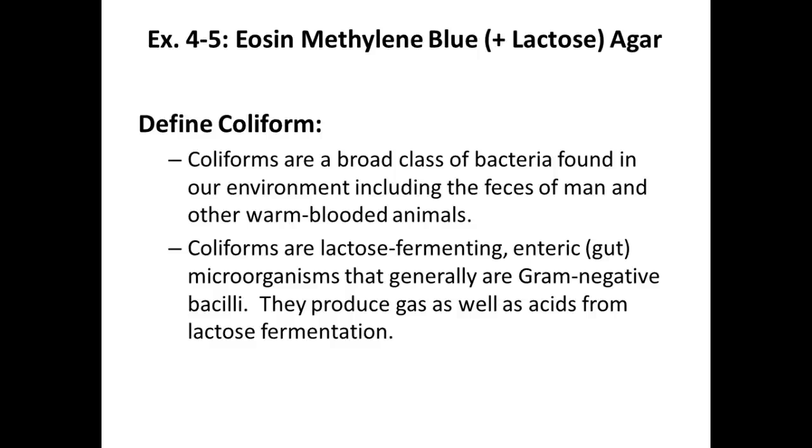So as I said earlier, we use this media because it has lactose in it, and we use a formula that just has lactose because that's really the question we're asking here, more so than the sucrose, which is just table sugar. Right? That's what sucrose is. It's what you have on your table. So these are gut microbes, hence why they could be found in your feces. They're gram-negative bacilli for the most part.